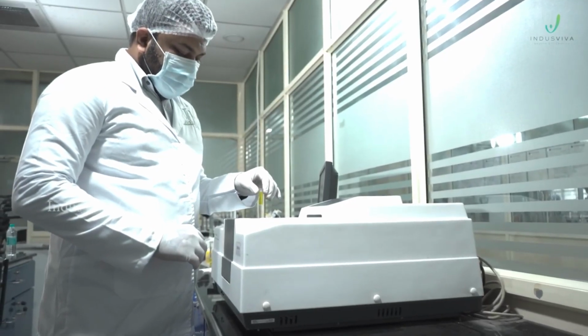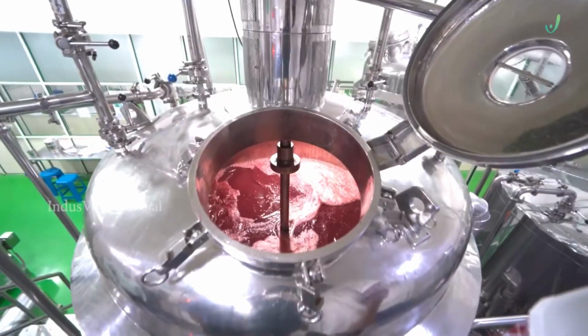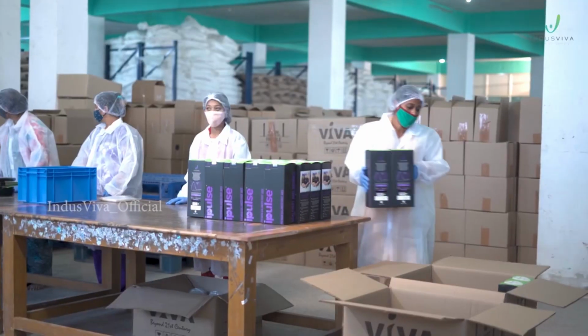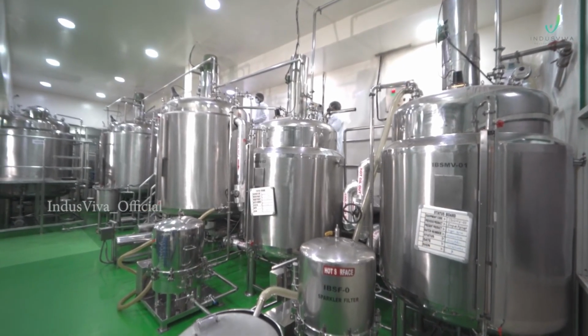Because it undergoes very stringent quality checks at all the points of the manufacturing process, right from sourcing of raw materials to dispatch of the final product. High-end analytical equipment are involved in the analysis.